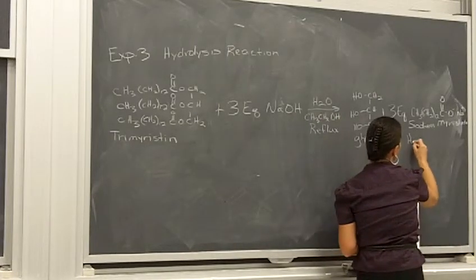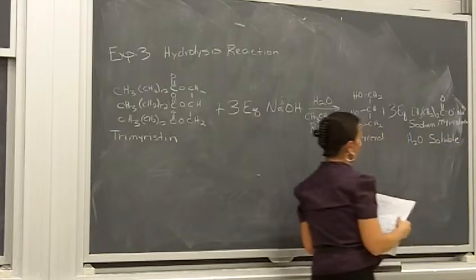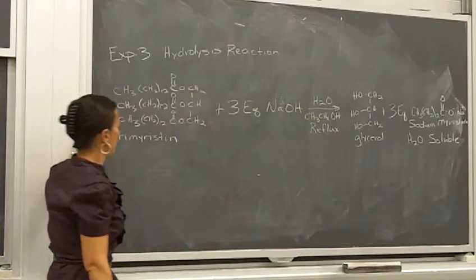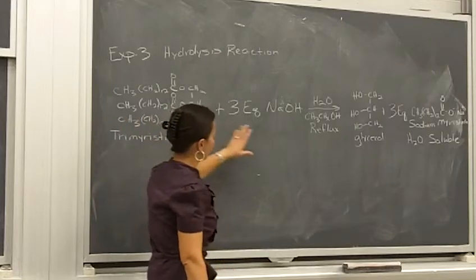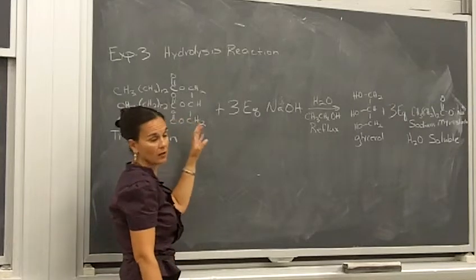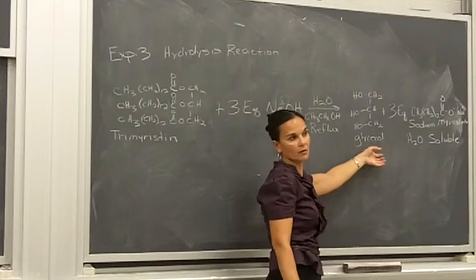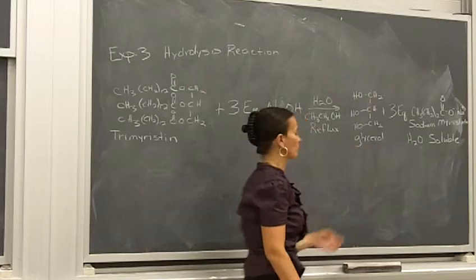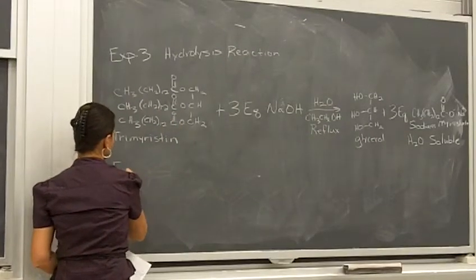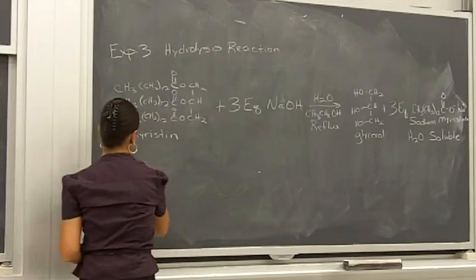This is water soluble. Even during the course of the reaction, this is not immediately water soluble, but as the reaction takes place, you'll see the solid being converted over to the sodium myristate as more and more of that solid becomes soluble, and at the end of your reaction, everything should be soluble in the reaction mixture, okay? Then what we need to do is take our sodium myristate and get our myristic acid out of that, okay?